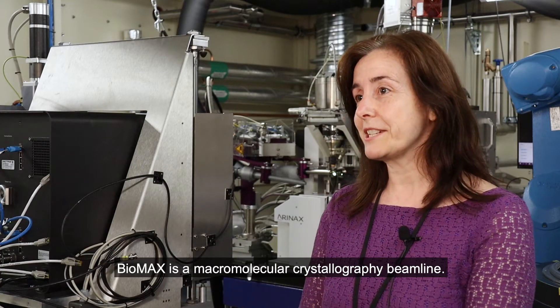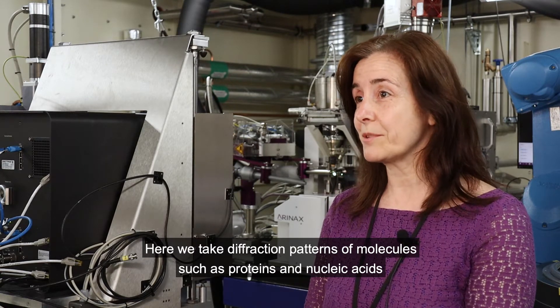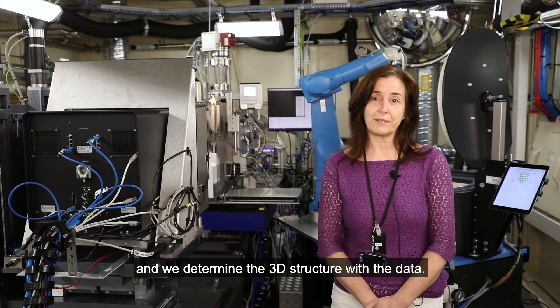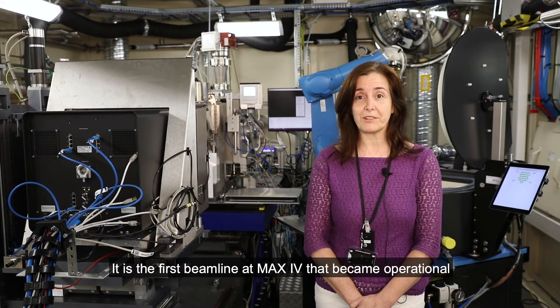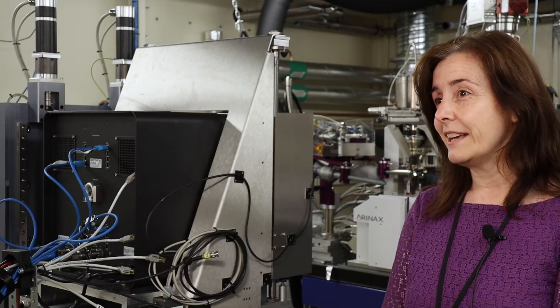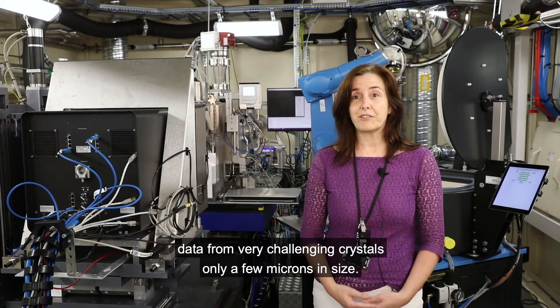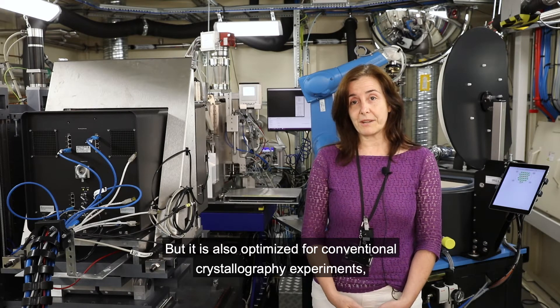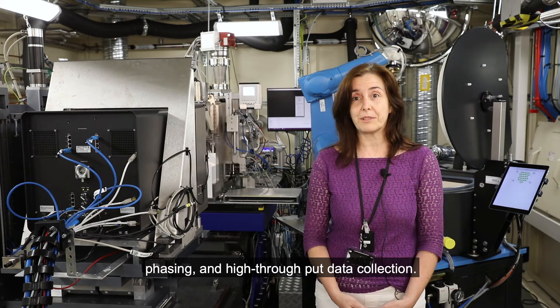Biomax is a macromolecular crystallography beamline. Here we take diffraction patterns of molecules such as proteins and nucleic acids and we determine the three-dimensional structure with the data. It is the first beamline at MAX IV that became operational — we've had users since 2017. It is designed to be a very versatile beamline: a microfocus beamline, which means that we can measure data from very challenging crystals only a few microns in size, but it's also optimized for conventional crystallography experiments, phasing, and high-throughput data collection.